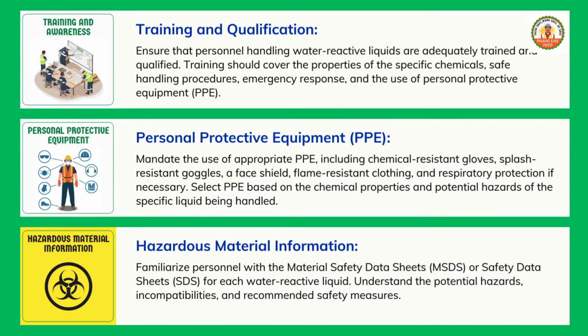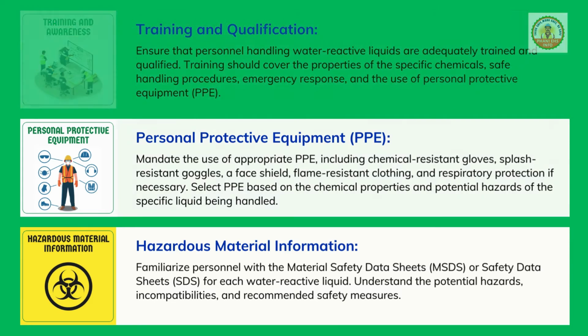Hazardous material information. Familiarize personnel with the Material Safety Data Sheets, MSDS, or Safety Data Sheets, SDS, for each water-reactive liquid. Understand the potential hazards, incompatibilities, and recommended safety measures.